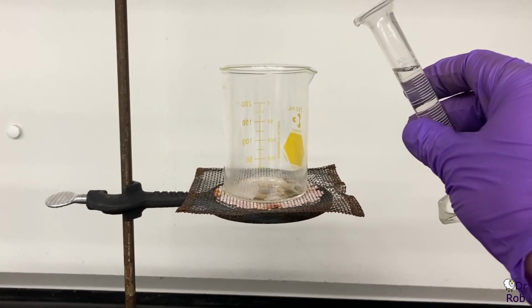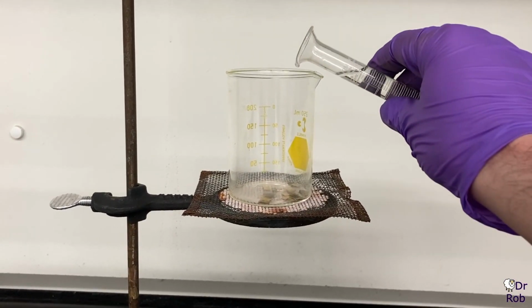So I'm going to add 10 milliliters of 15.8 molar nitric acid. It's a very concentrated solution of nitric acid. If you used a lower concentration of nitric acid, the reaction would be slower and you would potentially also produce NO instead of NO2.